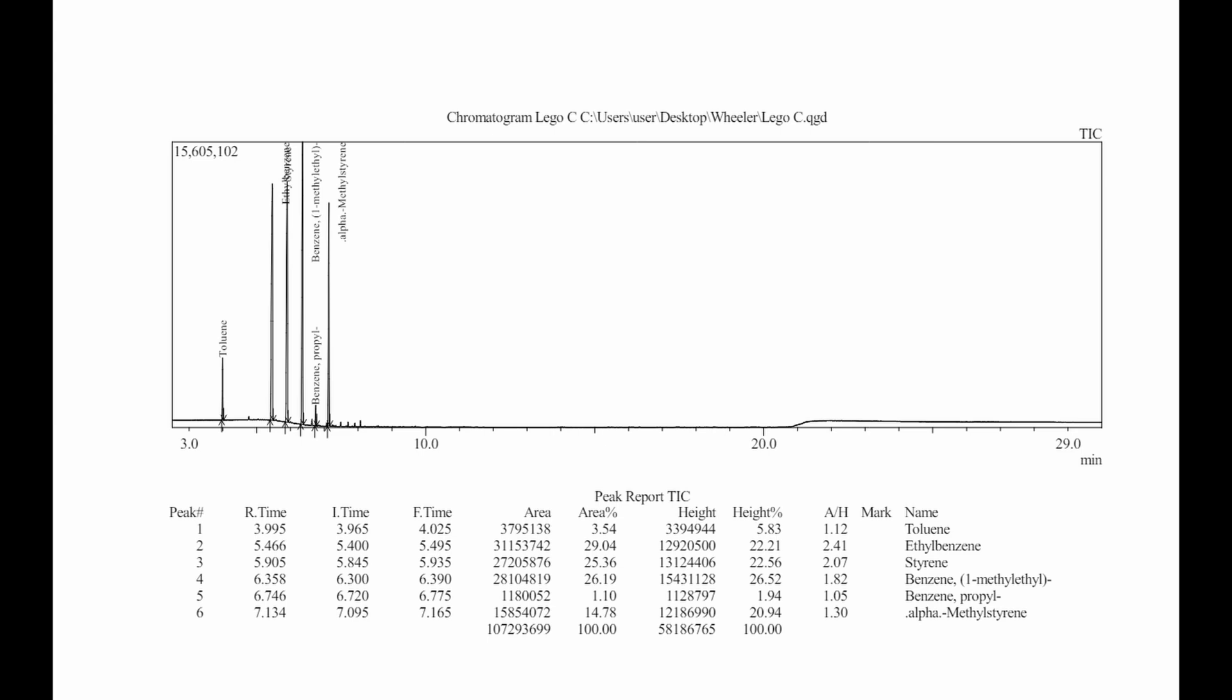The third distillate is composed of four main products, with trace amounts of toluene still present. This residual toluene could just be due to a couple factors. Some of it may have been still left in the condenser, or it could be part of an azeotrope formed during the distillation process.